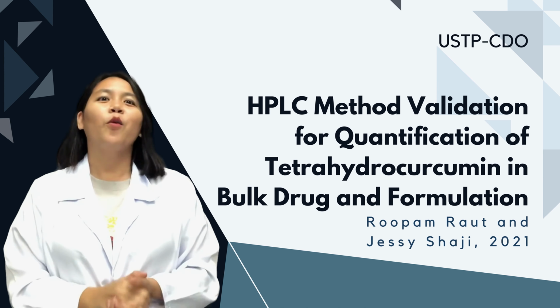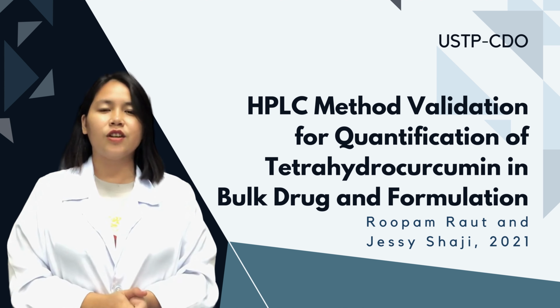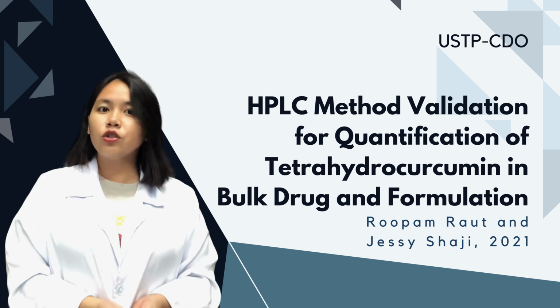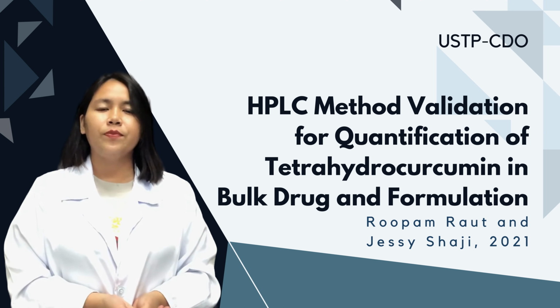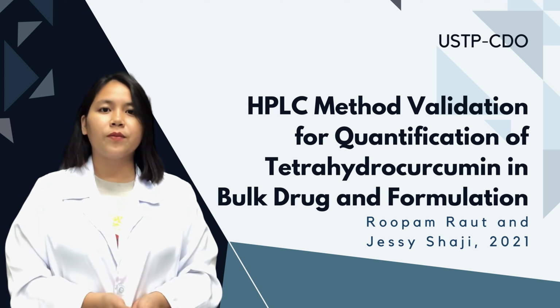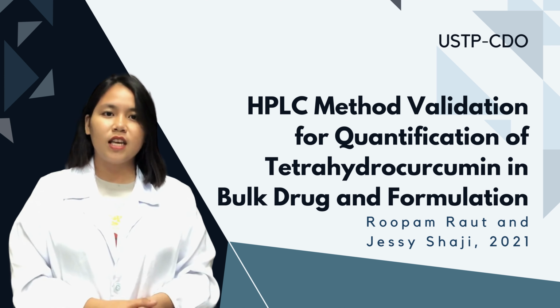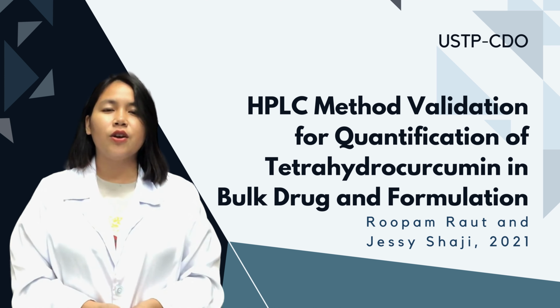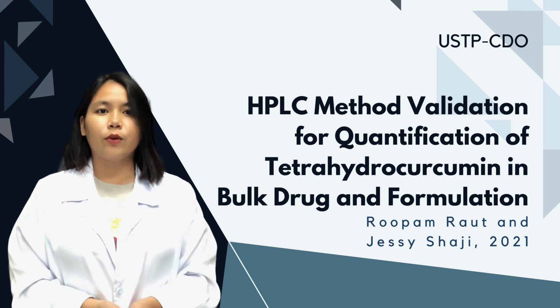Hello everyone! Welcome to this presentation on HPLC method validation for quantification of tetrahydrocurcumin in bulk drug and formulation by Raut and Shaji, published in 2021. In this video, we will be discussing the objective of the study, the procedure used, the parameters for method validation, results and discussion, as well as the conclusions and recommendations.